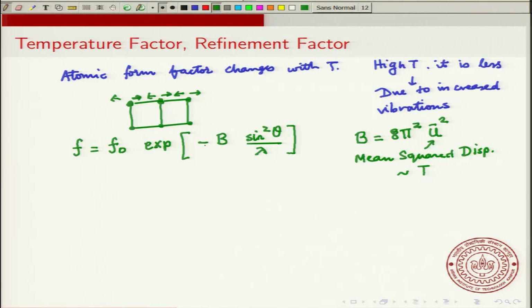Okay. Now, in addition to this, there is something called a refinement factor, which is now routinely used in all X-ray diffractometers.